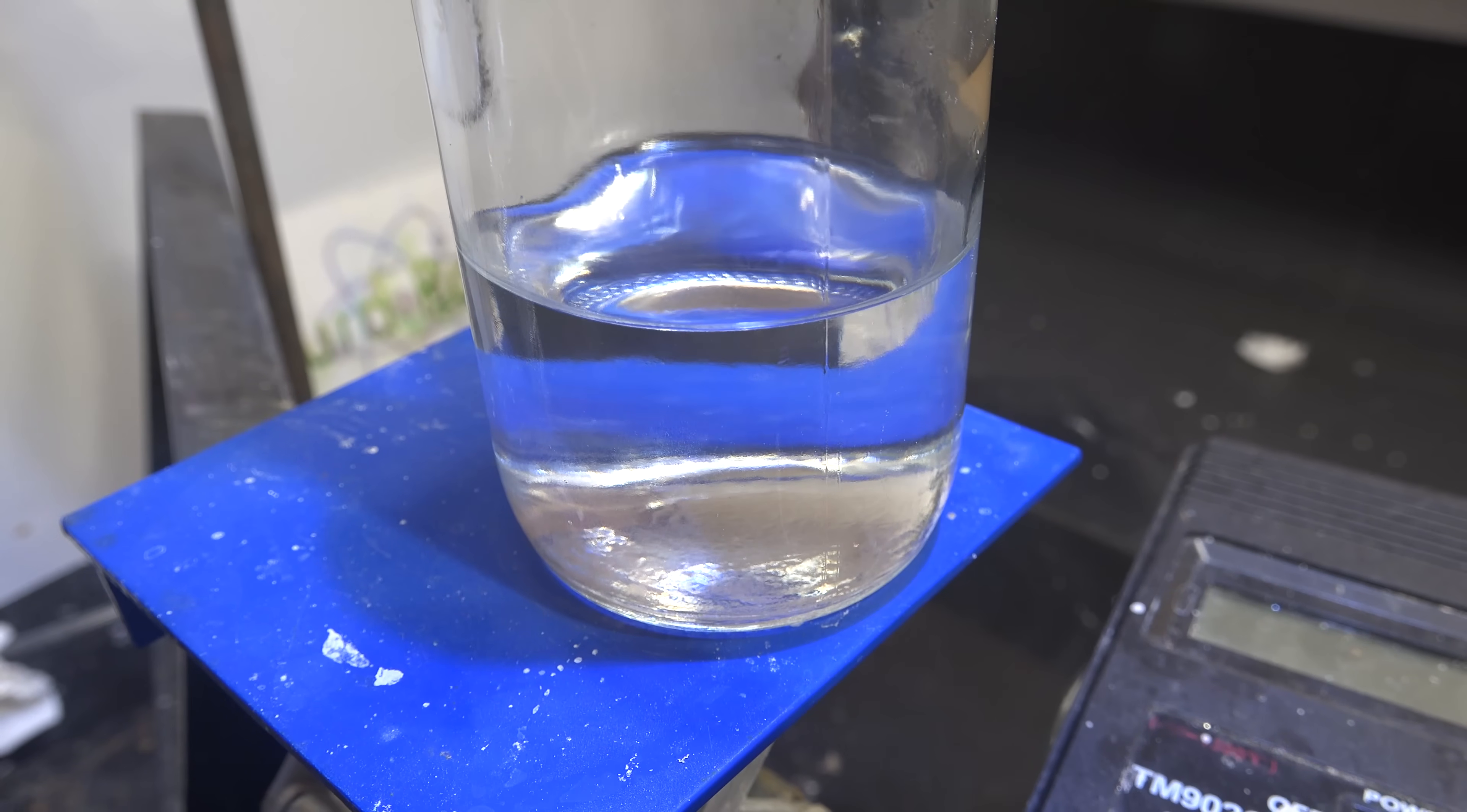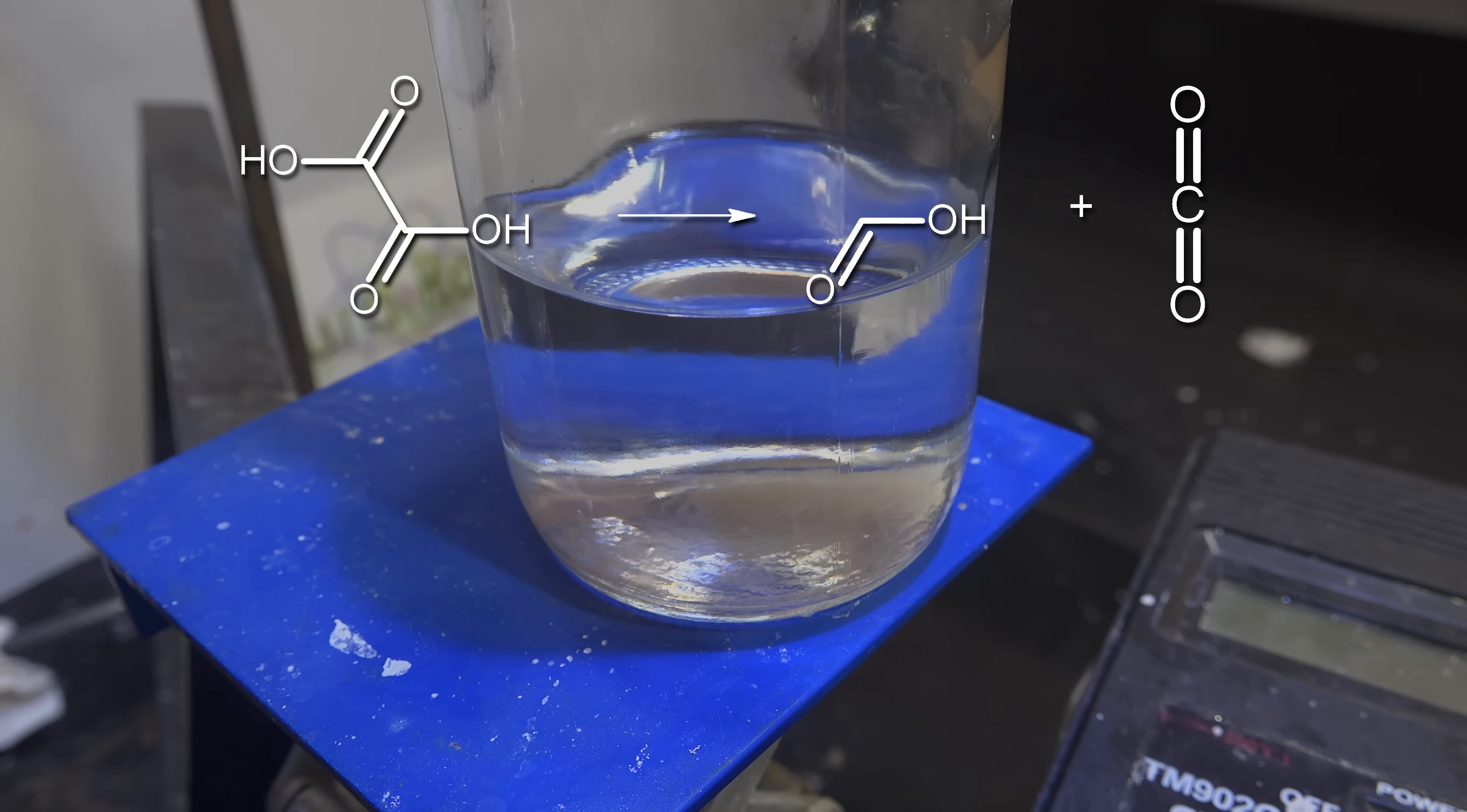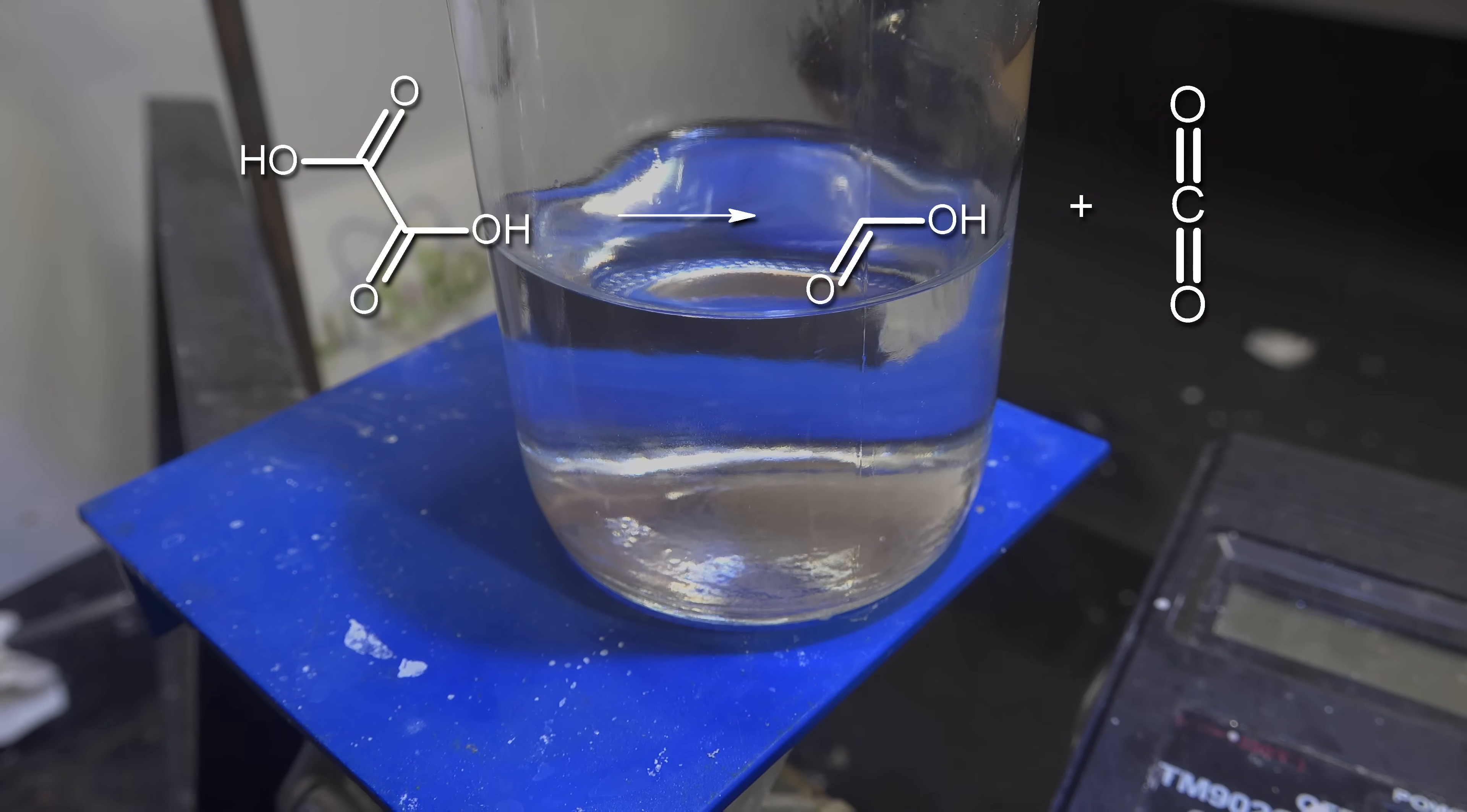In this video we'll make formic acid from glycerol and oxalic acid. The overall idea is that oxalic acid is essentially formic acid with carbon dioxide in it. So we're going to break that off by heating.